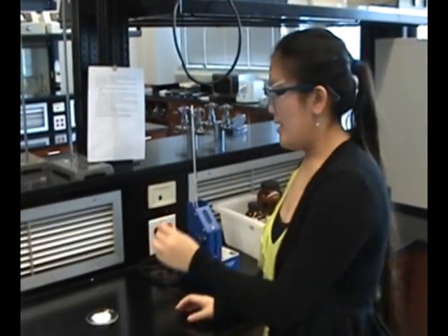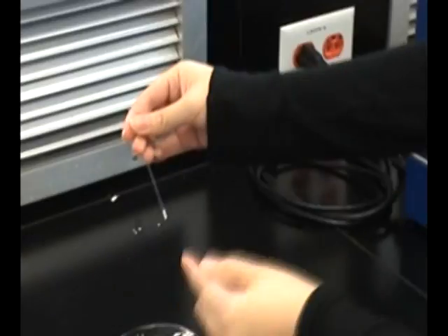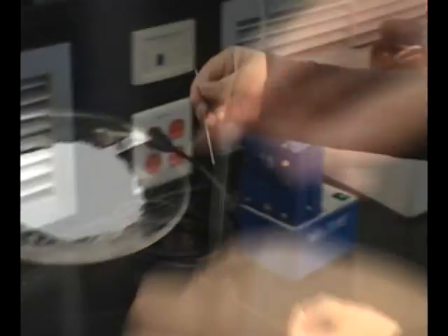Now I'll show you how to use the melt temp apparatus. First, take a capillary tube, invert it, and stamp some of the sample into the capillary tube. Once you get one to two millimeters of sample into your capillary tube, invert it back and tap it to the bottom of the capillary tube. Now you can insert the capillary tube. It is important to know where your sample is because you have to observe the change. The change you are looking for is the sample turning from a solid to completely liquid. The start of the melting is the start of your range, and the end is the temperature at which all the solids have converted to liquid completely.